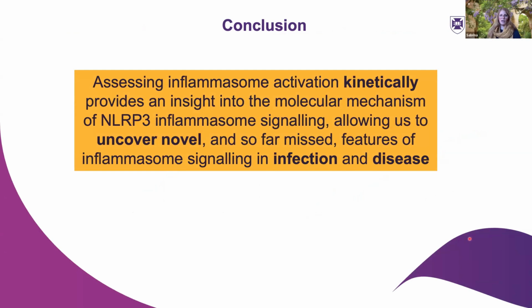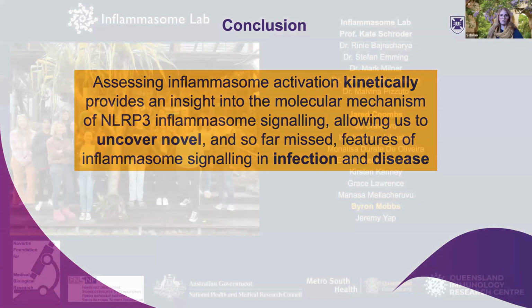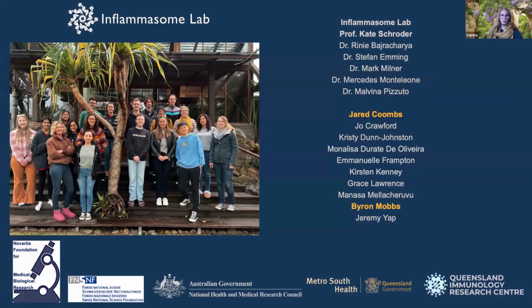So as a conclusion, I think what this technique really allows us to do is kinetically look at inflammasome signaling. And I think it really allows us to uncover novel and probably also so far missed features on how an inflammasome not only assembles, but then also helps us to prevent an infection. And hopefully we can also translate that into a disease setting where we can characterize what is going on in disease.